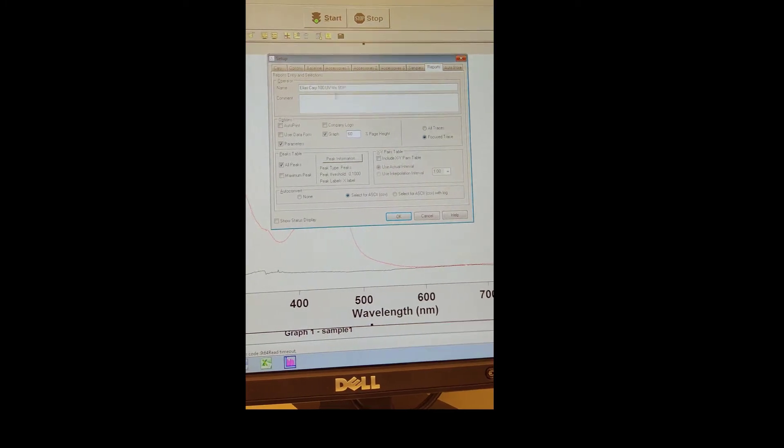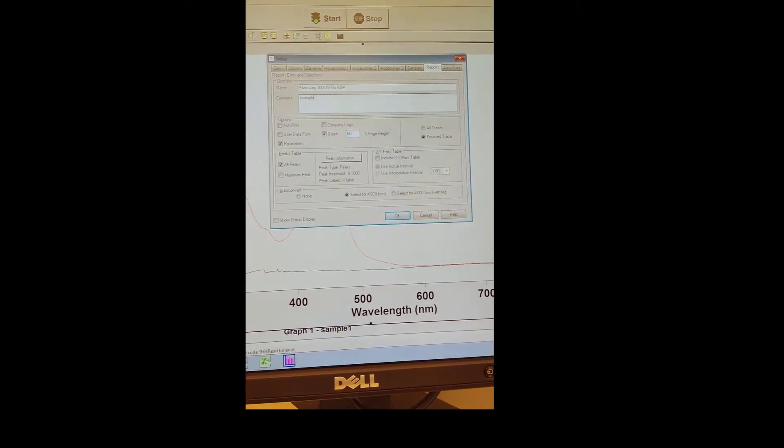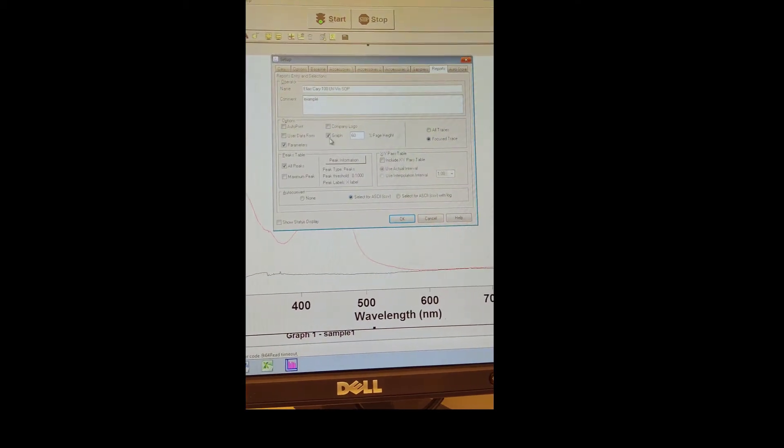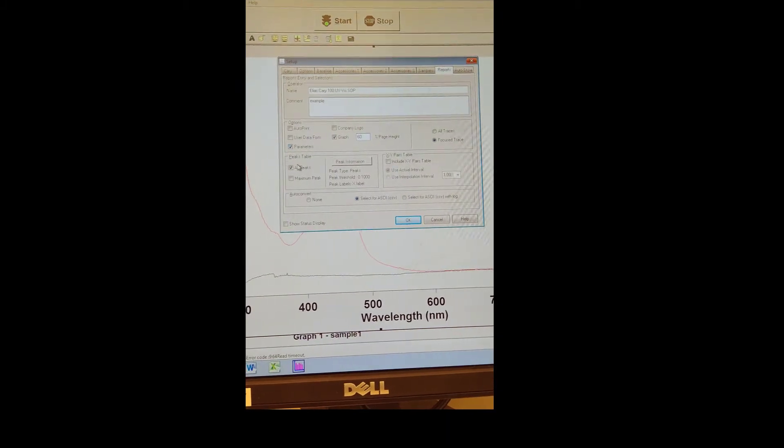Under Reports, give yourself a name as the operator. You can add a comment if you'd like. Under Options, I wouldn't really mess with that for now because I'm not printing out the spectrums today. If you were, I would change them as necessary.